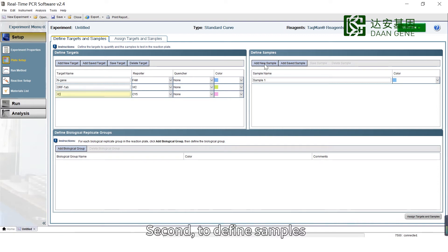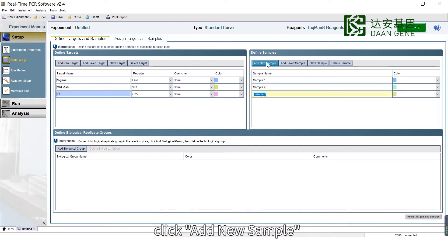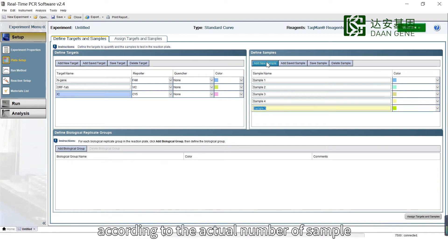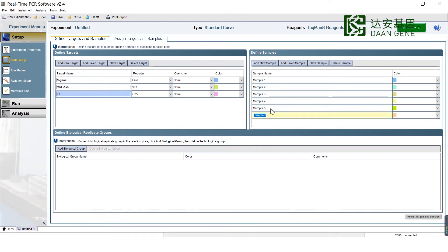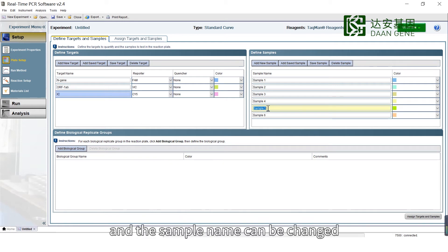Second, to define samples, click Add New Samples according to the actual number of samples. The sample name can be changed.